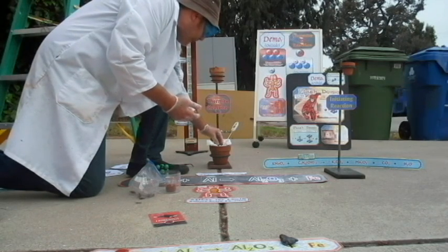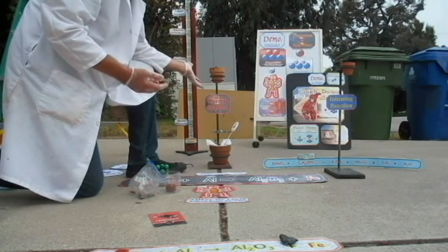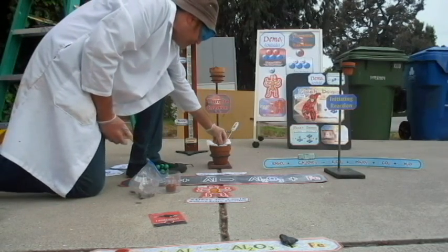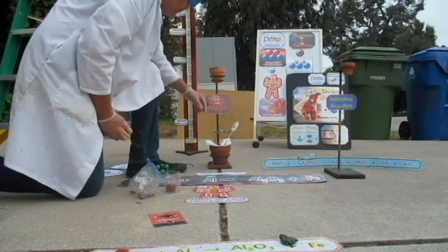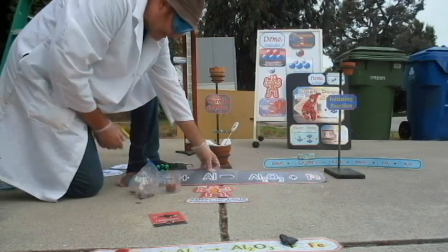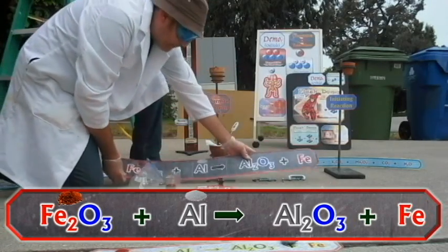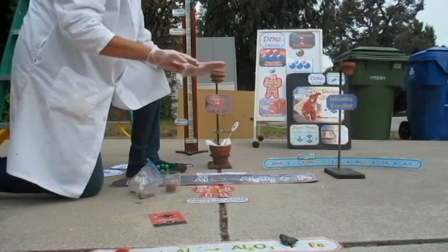So we'll have a little bit of platinum, a ring, like if this is Mount Doom, because this is going to come out as hot as lava, maybe it'll melt the ring or just start to melt the ring. We'll see what happens to this piece of platinum and this ionic compound. A metal and an ionic compound. They're going to be smothered with a whole bunch of the products of the thermite. The products of the thermite are going to be alumina and iron, molten iron. They will come out at a temperature that is hotter than any lava, anywhere, any lava.